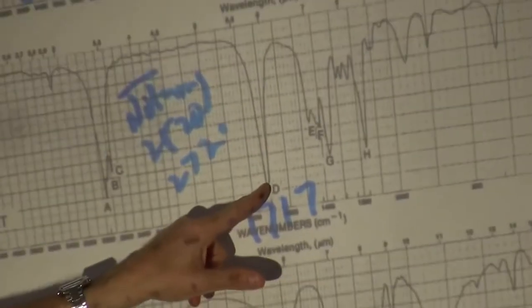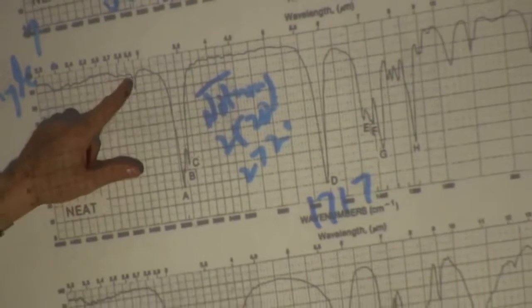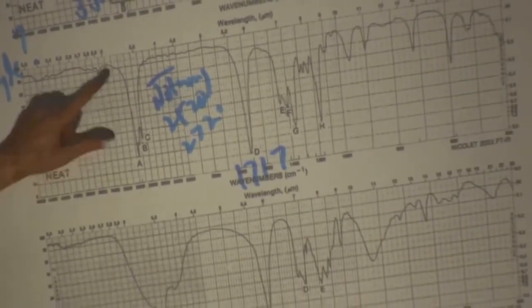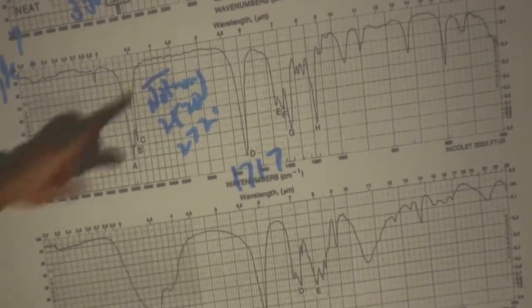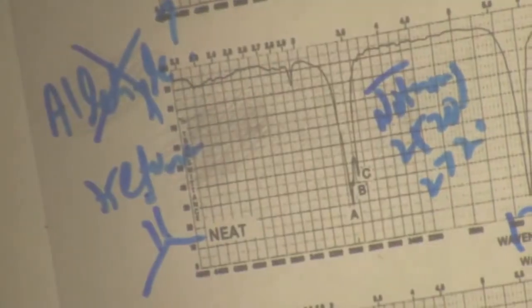It's high to be an amide, and we don't see any substantial NH. This type of thing is not uncommon. That could just be a little bit of water in your sample. And that really puts this at a ketone, just a simple and straight ketone.